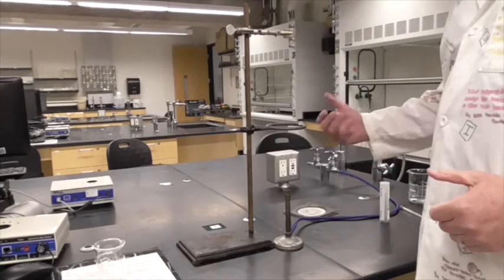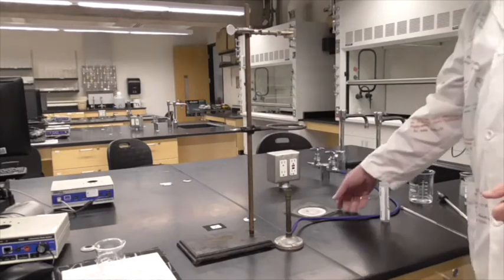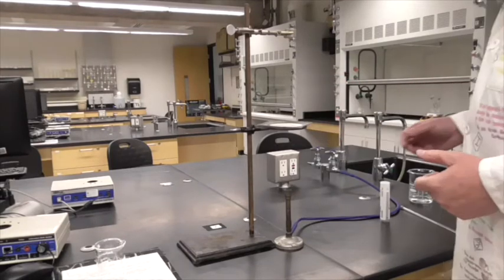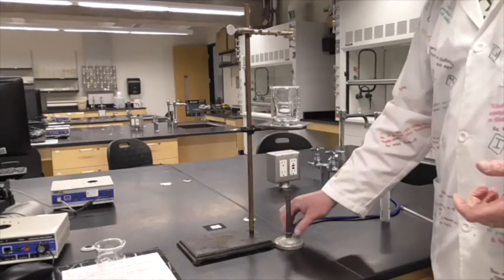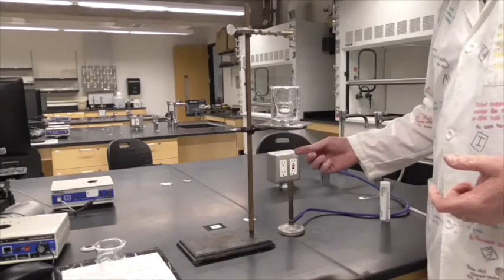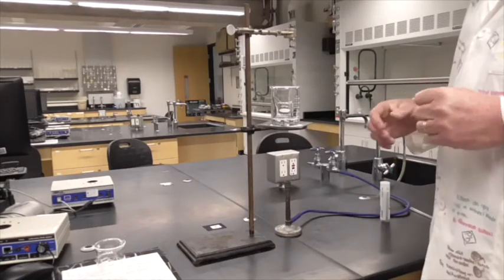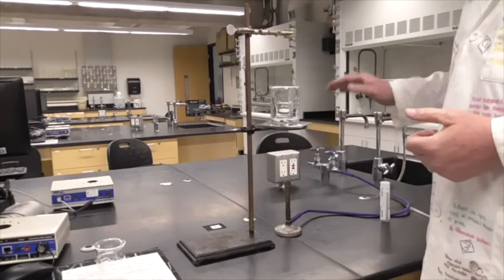So for all of our work today, we're going to use a ring stand. You can see we've got the stand here and we've got a ring on it. I'm going to put a wire gauze on the ring so that I can safely put a beaker on that wire gauze, and I can heat the water using a Bunsen burner underneath. We're going to do this for all three things we have to do today. For the paradichlorobenzene, we're going to heat the water to about 40 degrees, and then we're going to stop.